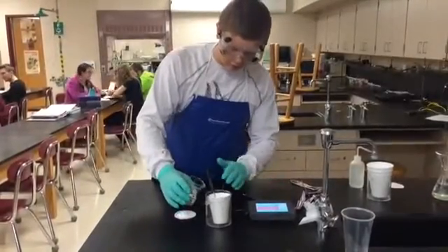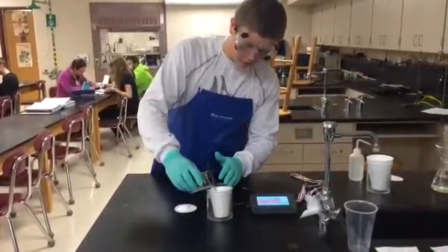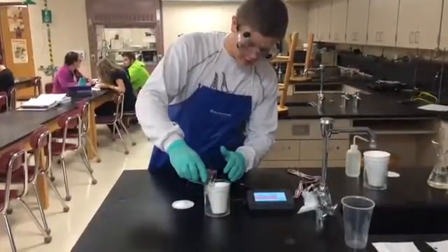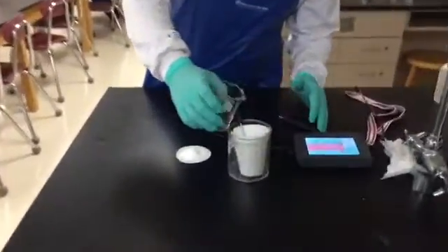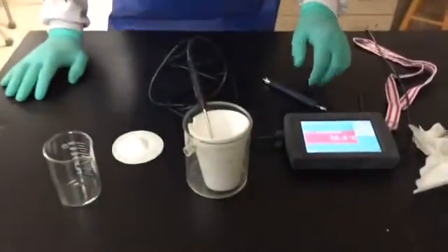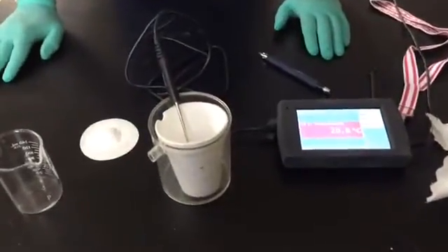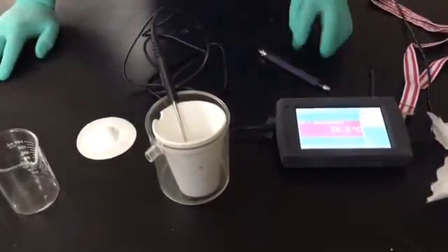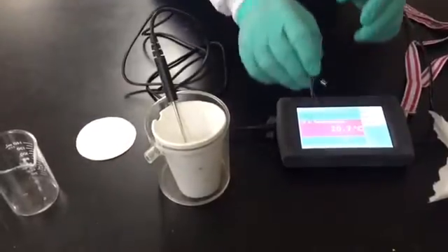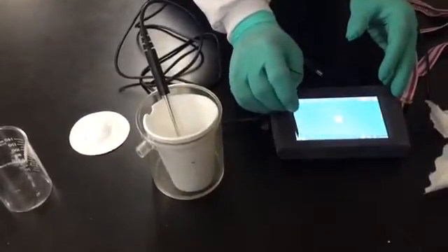This will be an example of a citric acid and baking soda reaction. Here I'm adding the citric acid into our styrofoam cup, which will be our calorimeter for this experiment. Now I will start data collection.